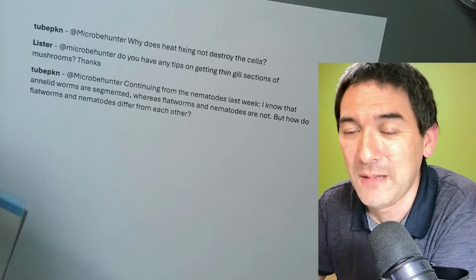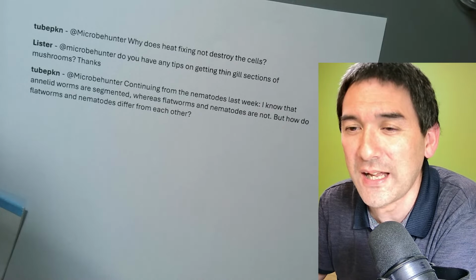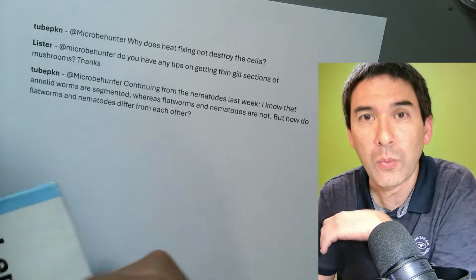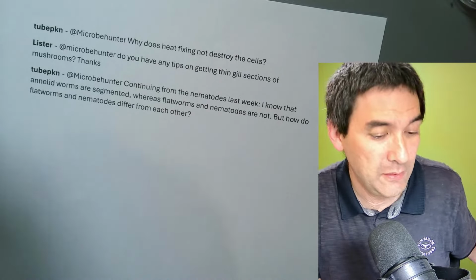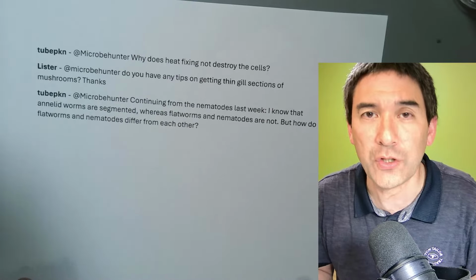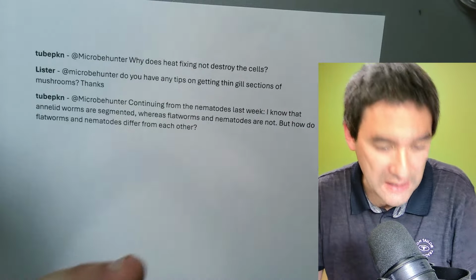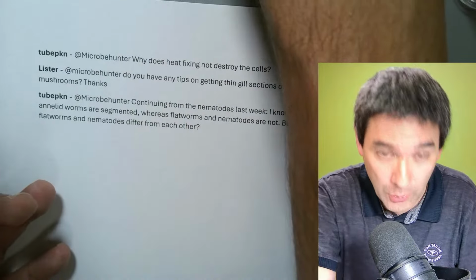Yeah? Maybe last question: is it possible to use slides on inverted microscopes? As a matter of fact, why not? I guess it depends a little bit on the stage of the inverted microscope. Inverted microscopes are used so that you can take a whole Petri dish. I have a small one over here.